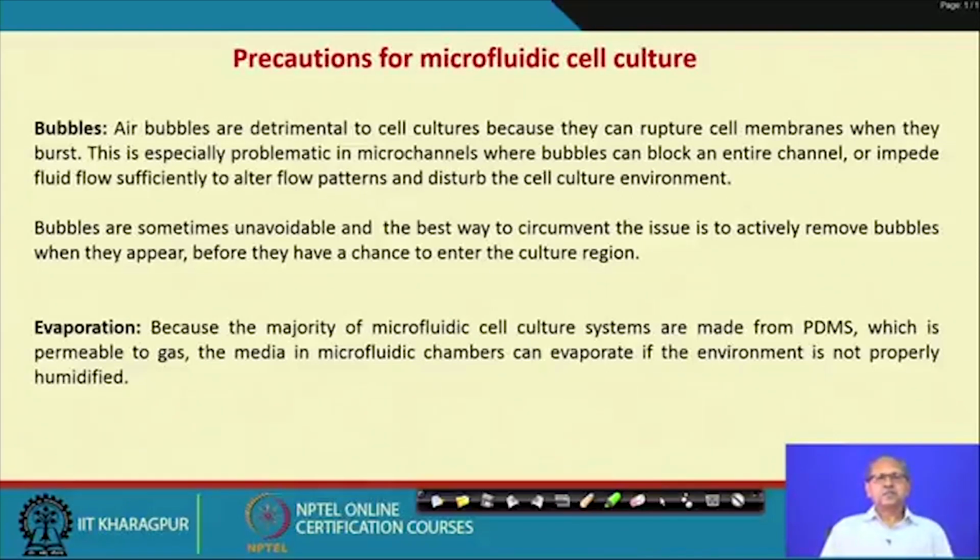If a bubble is unavoidable, then you have to remove it by an active process, or you should try to ensure the bubble does not enter the culture area, particularly. Sometimes bubbles clog the media entry and the cells die from deficient media.